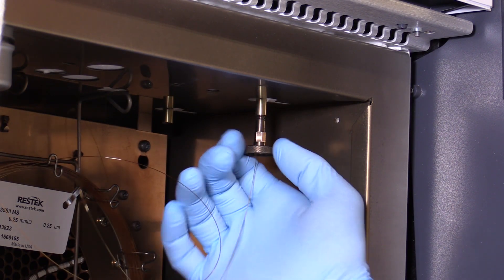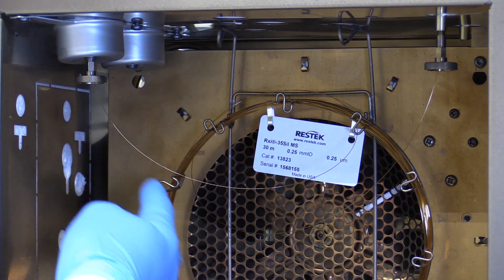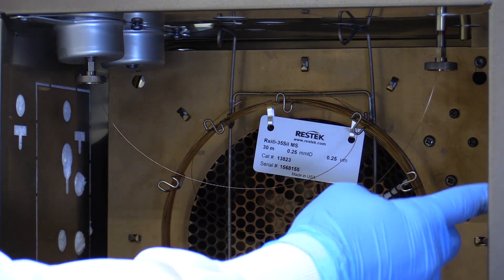After installing the inlet side of our column, we're going to run through the same steps for installing the detector end. And again, you can reference your instrument manual to ensure that you are setting the correct installation depth for the detector which you are using. Make sure that there are no severe bends in the column and that the column is not touching the oven walls.